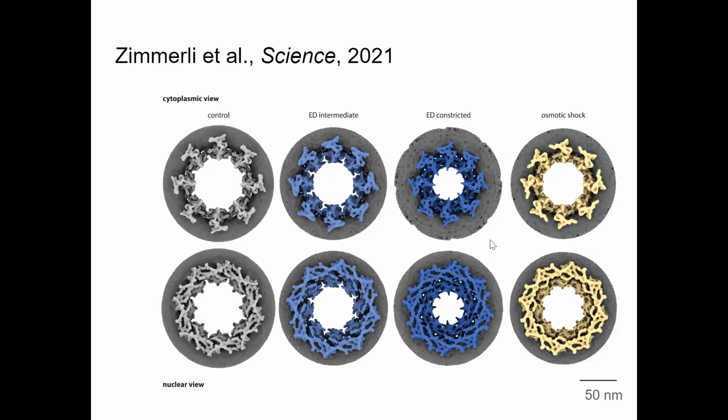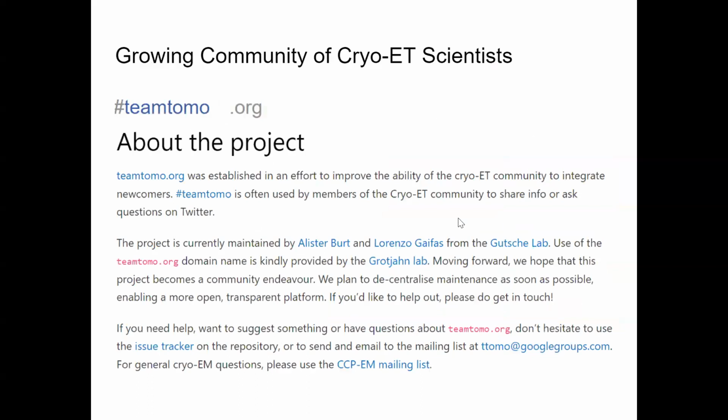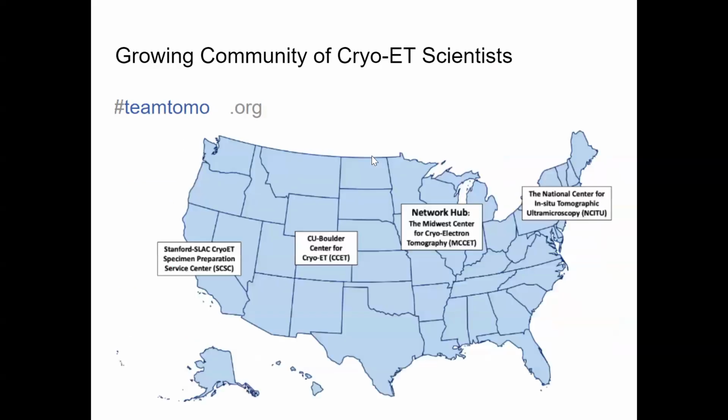These two studies demonstrate the power of Cryo-E.T as well as the immense amount of effort Cryo-E.T requires. With so many moving parts, the sizable community of Cryo-E.T scientists have formed online and in various institutions to help troubleshoot issues and develop new workflows and analyses. More techniques are being developed which provide scientists with even more tools to study nature at angstrom level resolutions.